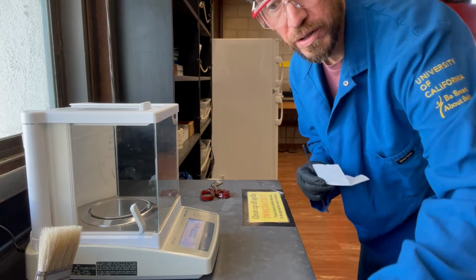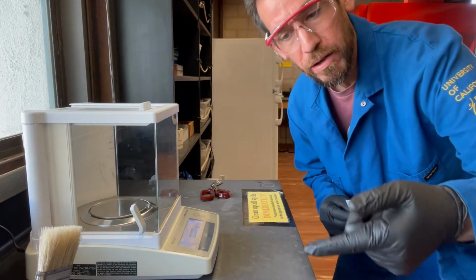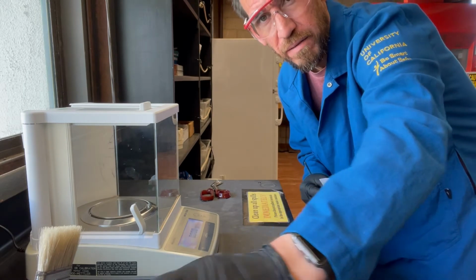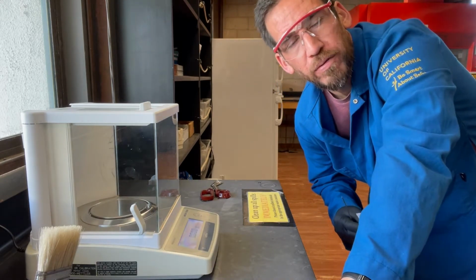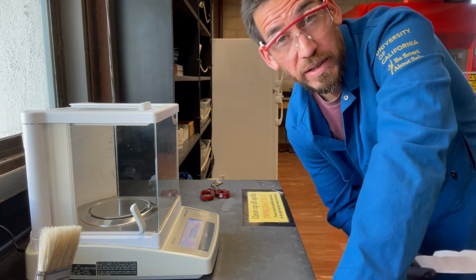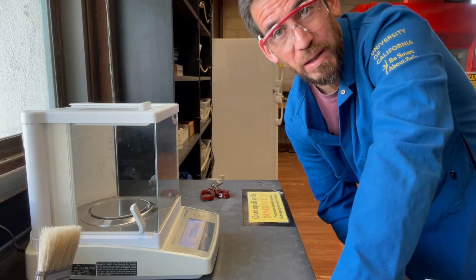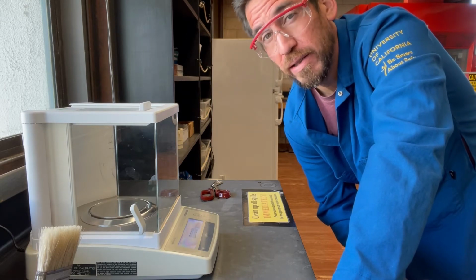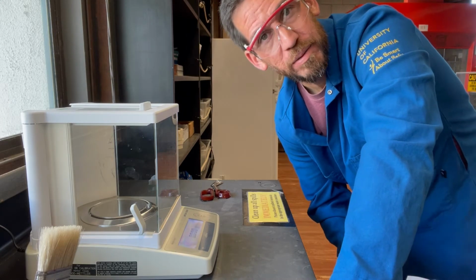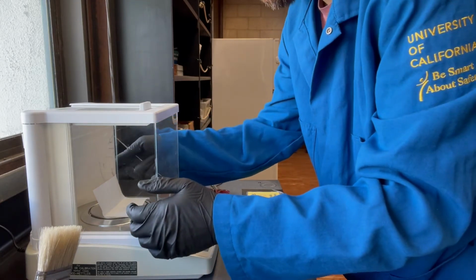All right, so what I'm gonna do here is weigh out about 5 grams of our benzoin, and then I'm gonna place it in here, and then I'm gonna throw both of these inside of the oven just to get them extra dry before we get that reaction started. Once I do that, I will start setting up the apparatus. It's an interesting setup, so it might take a minute, but I'm just going to show you the end result, and we'll see what we got here.